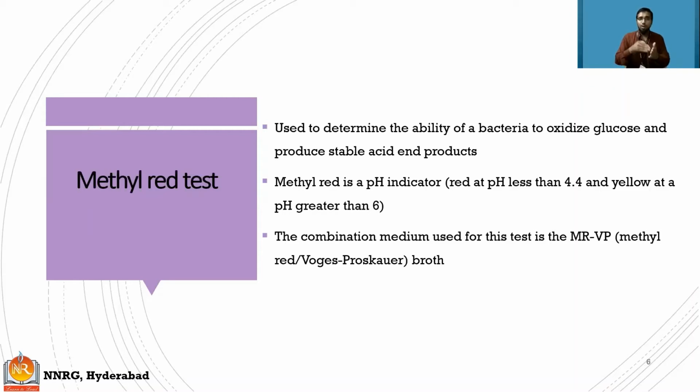So let me consider the aldehyde, which is the glucose molecule. Aldehyde means the first carbon has an aldehyde group. That aldehyde group has C double bond OH. If it undergoes oxidation, it means addition of one oxygen. When oxygen is added to COH, what will it be? COOH.